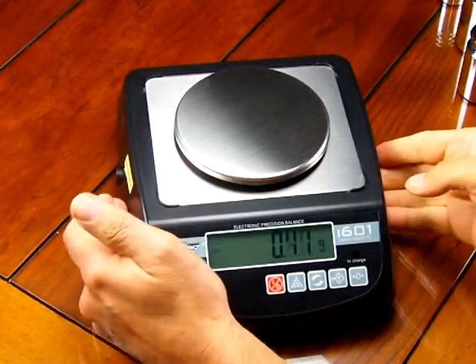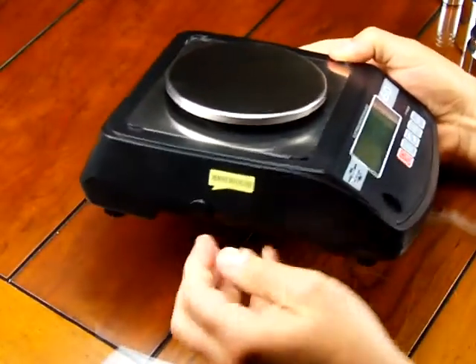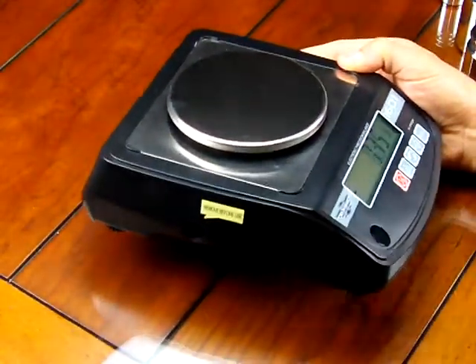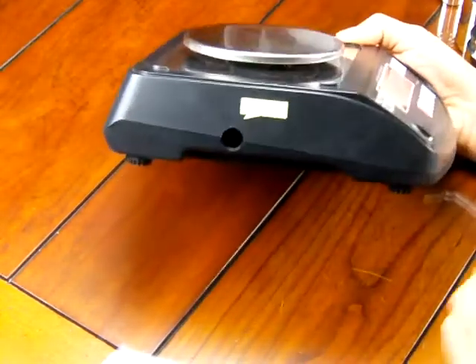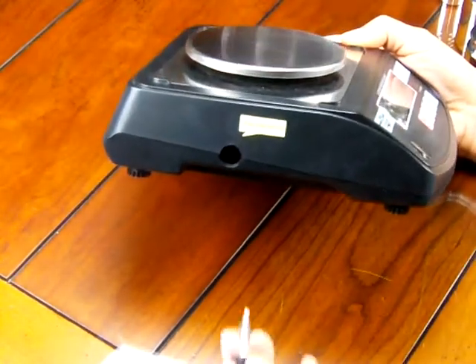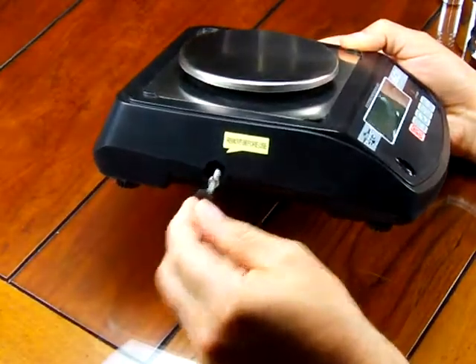So I just want to show you a few more features that the scale has to offer. The MyWay I601, on the side, when it's delivered, there's a lock-in pin that prevents the load cell from being damaged.